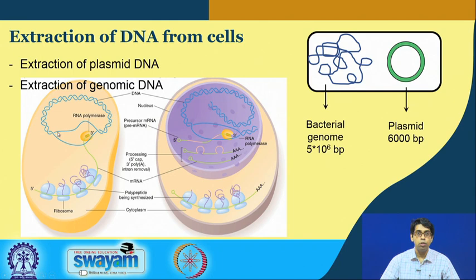In case of eukaryotes, the DNA is in the nucleus, but again when we break open the cell membrane, we break open everything and all the cellular components are out in the solution, and from there we have to purify the DNA. So, it is quite a challenging task, and we have to go through several steps to get very high quality, pure DNA.